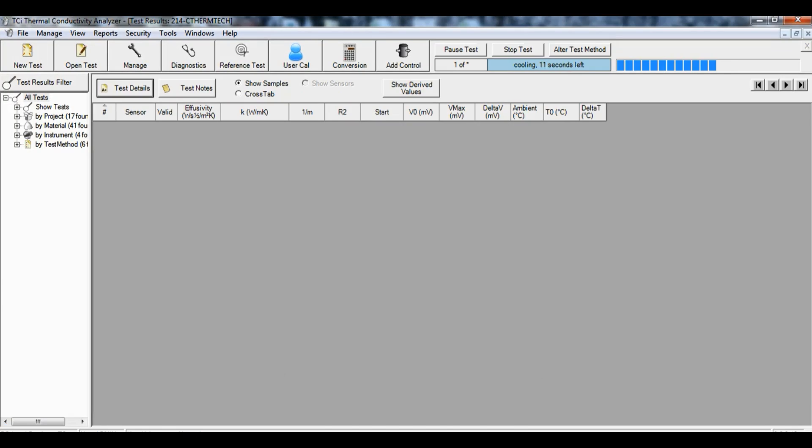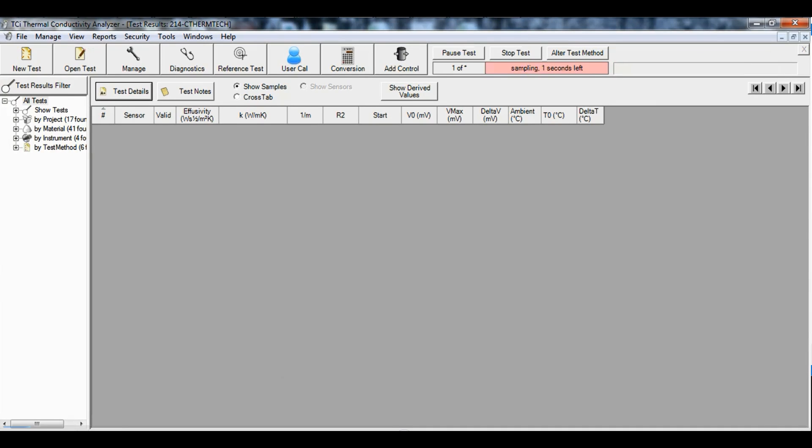Now we'll immediately see what is happening in the far right corner of the software as we do an initial cooling phase. Then we'll see a heat pulse and measurement value, another cooling phase of 60 seconds.